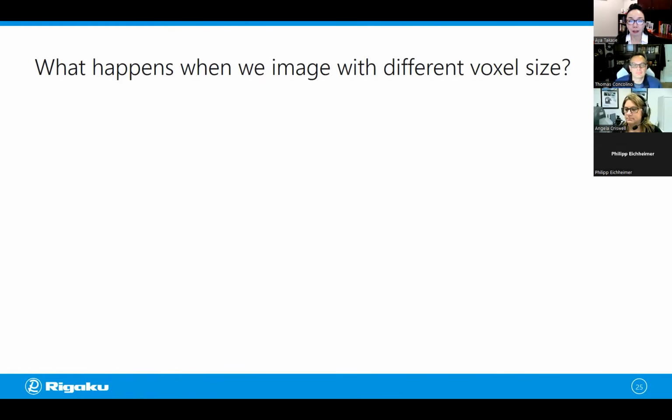Okay, so I'm going to end the poll in 3, 2, 1 and share the results. So it's pretty split, but I think the first one was the most popular. Decrease the voxel size helps us to resolve fibers in CT data. Are there any wrong answers to choose, Angela? There are. It turns out the favorite answer here, the most selected, is absolutely correct.